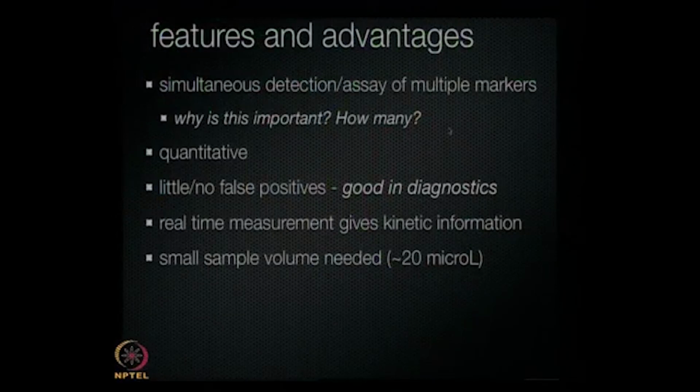In our case, though, the sample volume that's needed is very small. It really all depends on how good that little sample cell is. As I said, using double-sided tape, we can get it down to 20 microliters. And that's like a small droplet. Right, I think that's very important, because if you're talking about clinical samples and measuring things in clinical settings, how low we can go is very important. That's right. But even in your experiments in the lab, because proteins are very expensive. Yes. So the smaller the volume, the more experiments you can do cheaply. Definitely. So it's always better to work in the small volume, where possible.